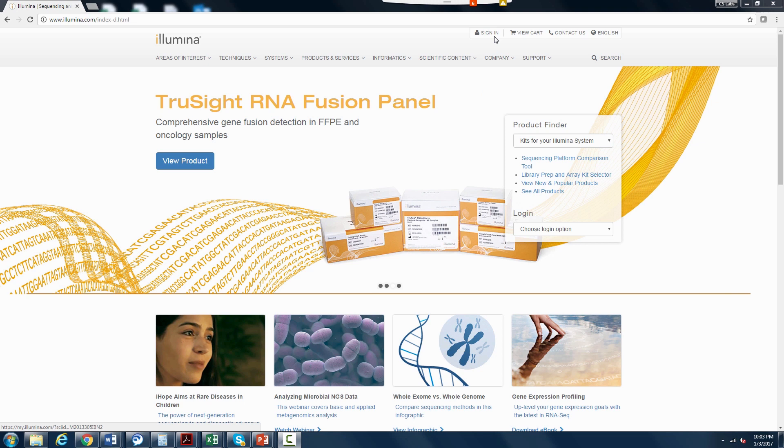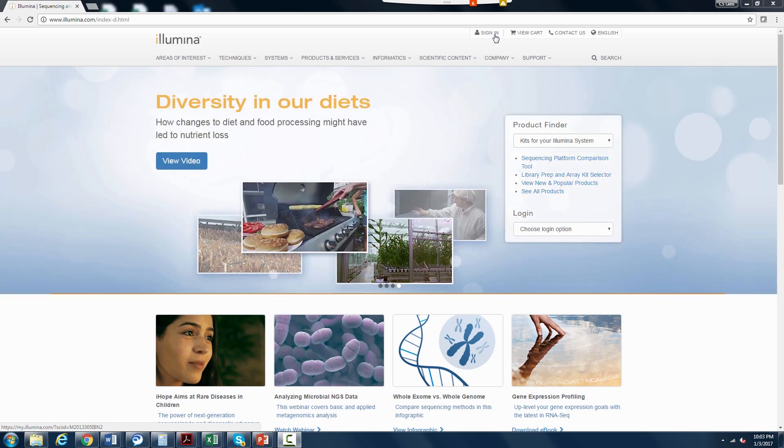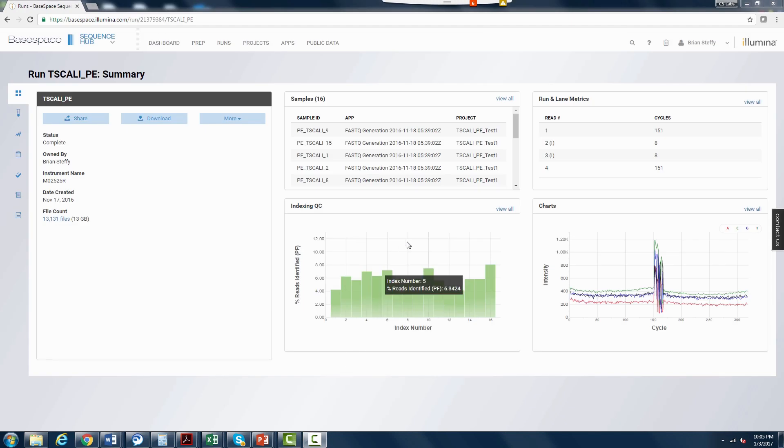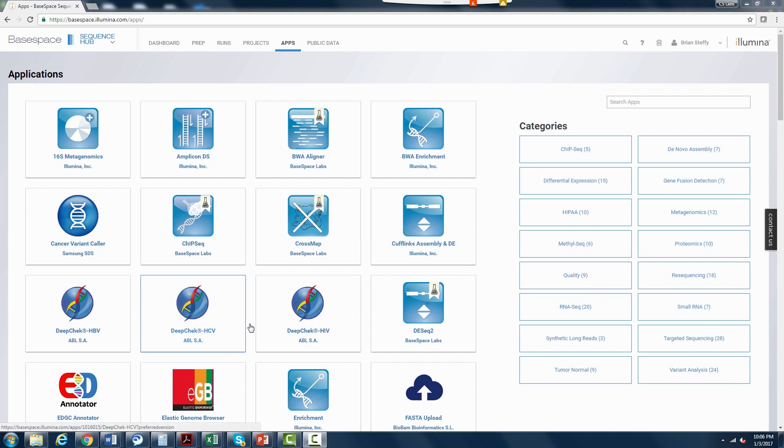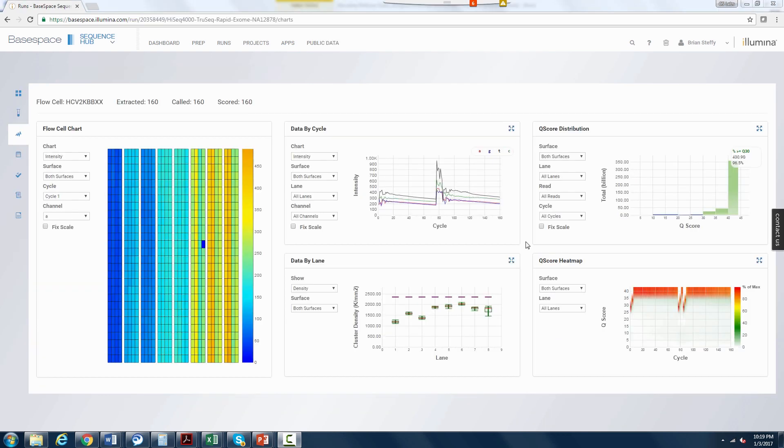A big advantage to using one of Illumina's sequencers is the capability of streaming and analyzing data on BaseSpace. If you don't have a BaseSpace account, you can sign up for one on the Illumina website by clicking the My Illumina tab at the top right of the screen. Once you have an account, it is possible to monitor ongoing runs on any of our sequencers. You can analyze data using one of the many apps available in the App Store, access public data from previous runs, or further analyze data using BaseSpace Sequence Hub. In addition, you can perform analysis on your system directly with Local Run Manager.